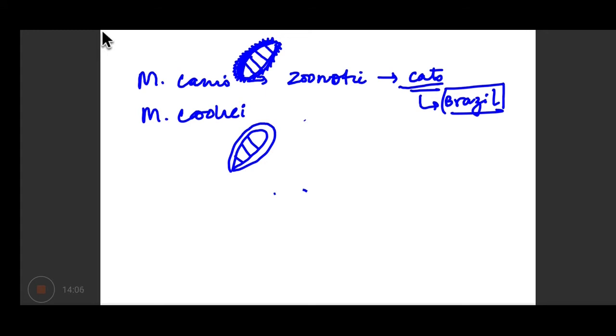But if there is any question, you can please ask in the question box. I see Prakhar has replied. Red pigment. I think you have spoken for this Trichophyton rubrum. Correct. It gives a red color on the reverse. You all can please post your questions in that question box, and I will simultaneously answer them. And if something is not clear, if you feel that it's not clear, then I can re-explain it. Then we quickly move on to gram staining of gram-negative bacteria.